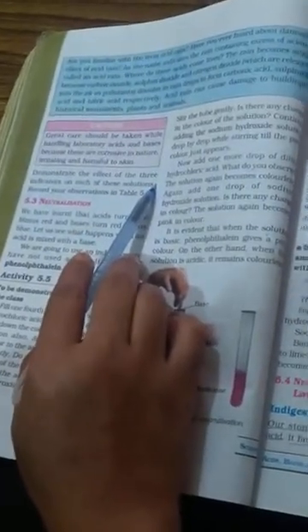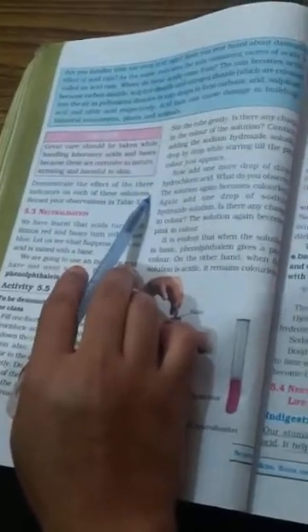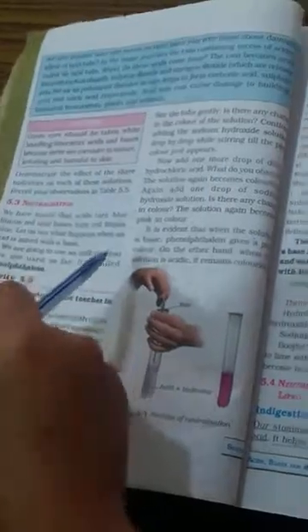Demonstrate the effect of three indicators on each of the solutions. Now this is what you have done. The two activities we have done. Now you must be knowing how to tell whether a substance is acid or a base.